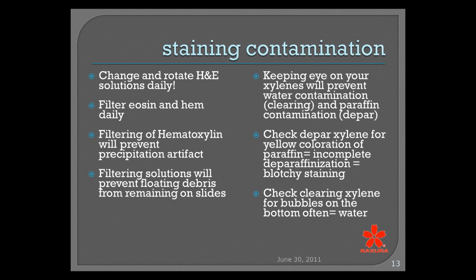So keeping an eye on that water content on the bottom of your xylene. If you experience it, you need to change your 100%. If you're consistently experiencing this over and over with each run, then you need to revisit your actual H&E protocol. It could be that you're not spending enough time in your alcohols in order to remove all of that water from your specimen before you're hitting xylene.